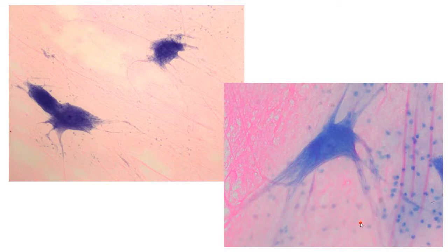So nervous tissue, our last kind of tissue. There is a note in the guided lesson. Make sure to compare this to fibrocartilage connective tissue. It's not that it actually looks super similar as much as that's another one where we told you to look at the colors. That's another type of tissue that's blue and pink. So just make sure we don't mix up our blue and pink tissues. It should be pretty easy not to.